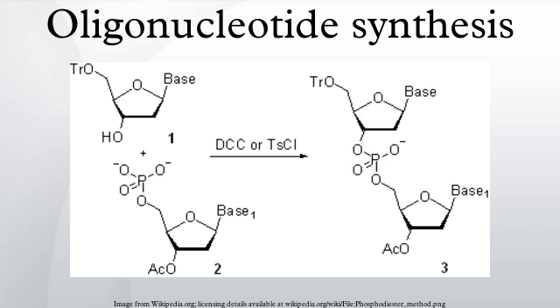The characteristic feature of the universal solid supports is that the release of the oligonucleotides occurs by the hydrolytic cleavage of a P-O bond that attaches the 3'-O of the 3'-terminal nucleotide residue to the universal linker as shown in Scheme 6. The critical advantage of this approach is that the same solid support is used irrespectively of the sequence of the oligonucleotide to be synthesized.